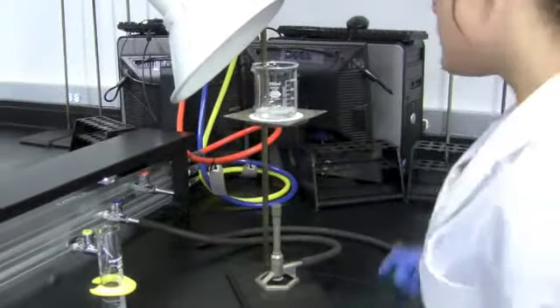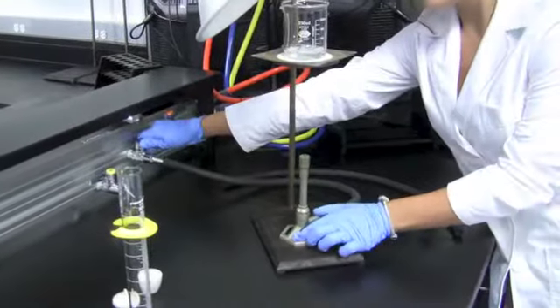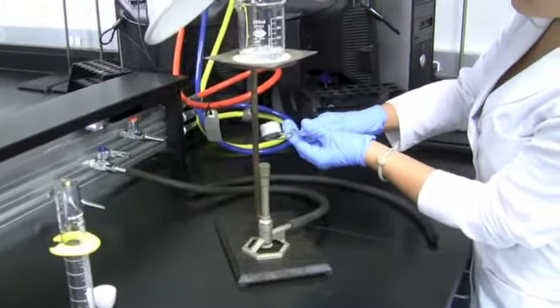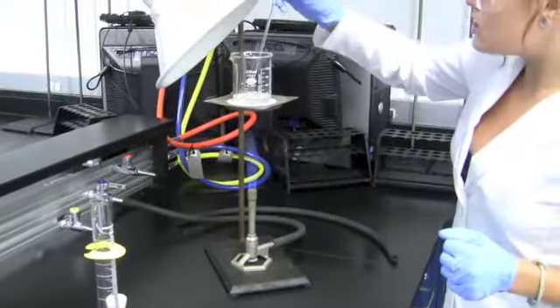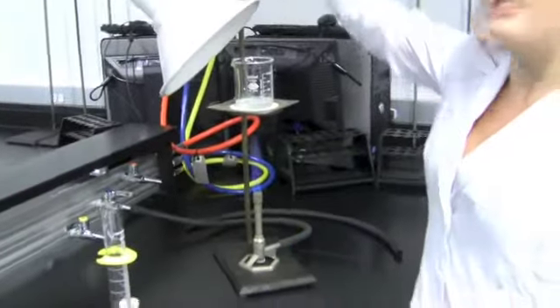We need to heat the solution, so I've hooked a hose up to the gas. We turn on the gas. And we're going to slowly heat the solution. Make sure that it's under the hood so that the hydrogen gas can get sucked up into the vacuum.